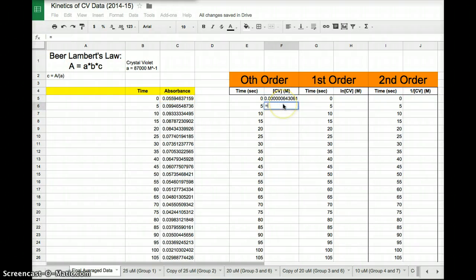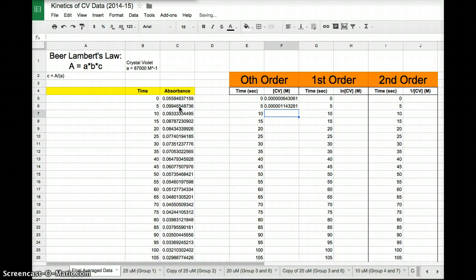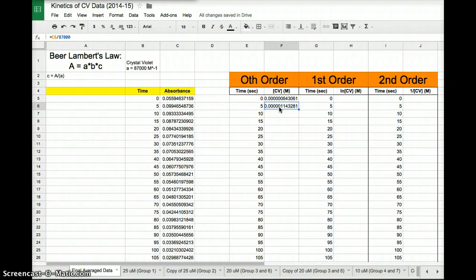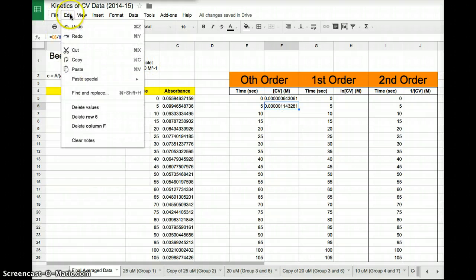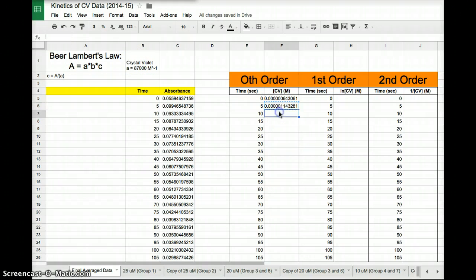So I could keep typing it in again. I could go boom, equals to this number divided by 87,000. And I could type that over and over and over again. Or what's cool about Excel and spreadsheets is I can copy not the number in the cell, but the function, the F of x. So I'm going to go here and I'm going to go file, excuse me, edit, copy.